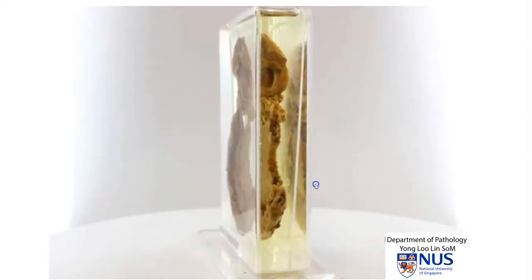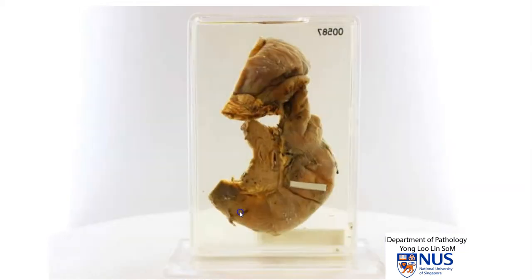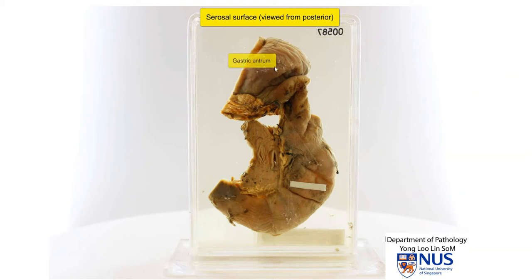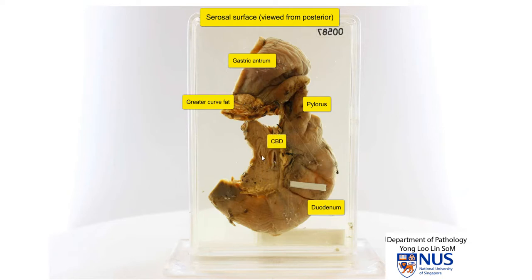Turning this around, we have the serosal surface now — that is the antrum, the pylorus, the duodenum, the pancreas, and we have a little bit of fat here at the greater curve of the stomach. This again is the common bile duct, and this possibly is the pancreatic duct.